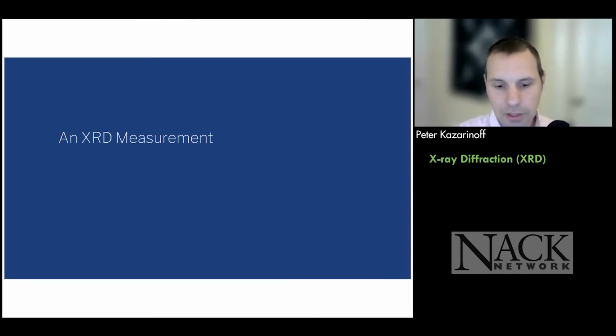So next, we're going to talk about how an XRD measurement is actually accomplished. And I've got a couple of short videos to show you. Since we're in a virtual setting, I can't introduce you to an actual lab that shows an X-ray diffractometer, but I've got a couple of videos to show you about how it works.